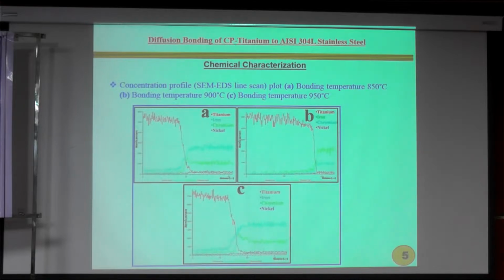So initially, after bonding is over, we have to do visual examination, then cut, and prepare the sample metallographically. The interdiffusion kinetics we can study by the EDS analysis. For visualization and topography study, we can use SEM. What phases have evolved? That we can detect by the X-ray diffraction, XRD, technique.